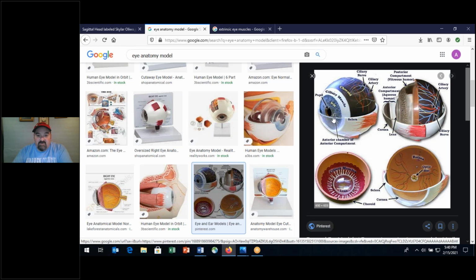You'll see here that we have the iris, the pigmented portion of the eye, that is a muscle that creates this opening, this hole, this pupil, okay? And then you'll see here the choroid layer, which would be the brown vascular middle layer. It's stained brown because it's pigmented, folks. This helps prevent scatter of light as it enters into the eye.